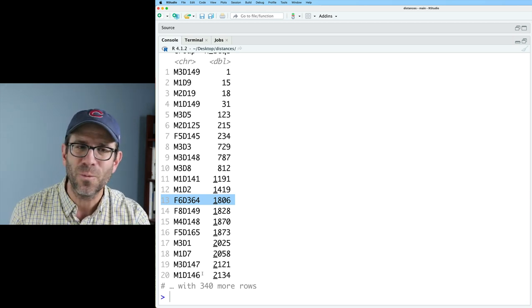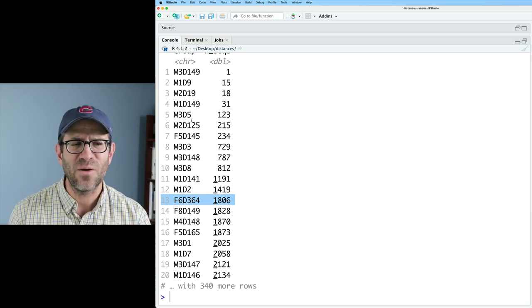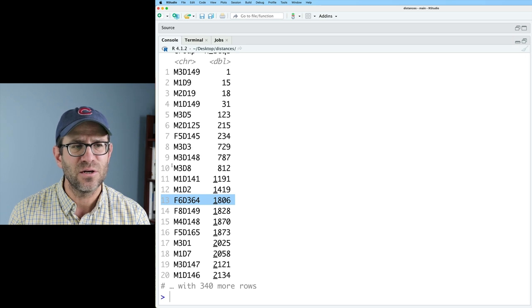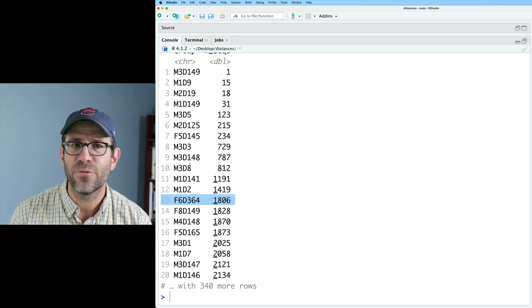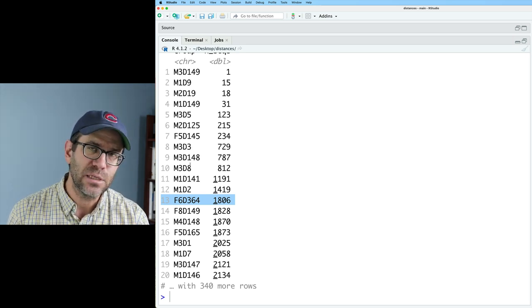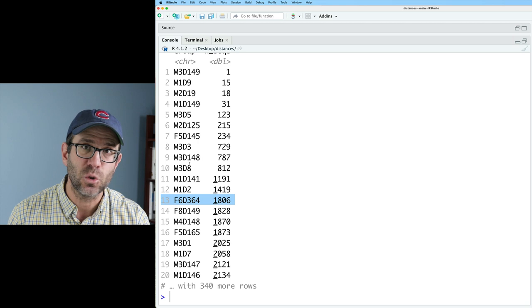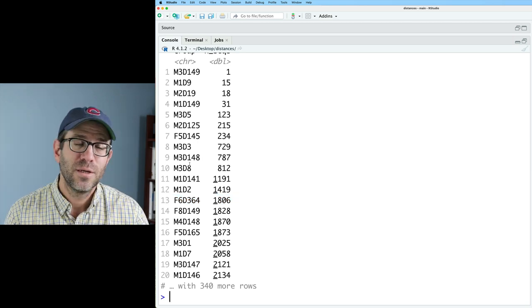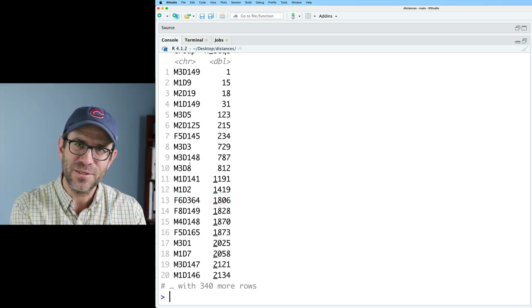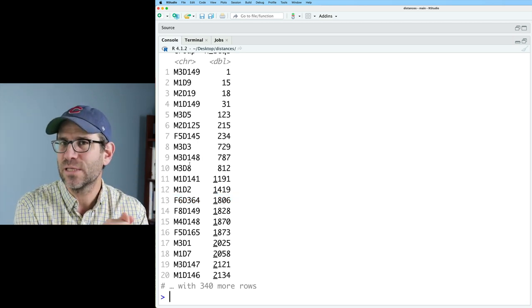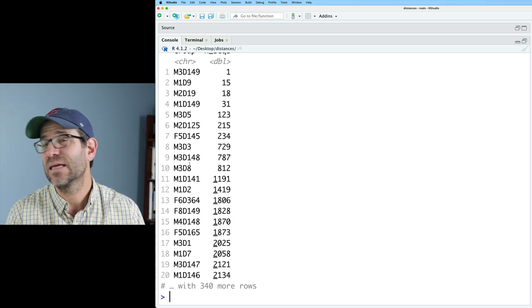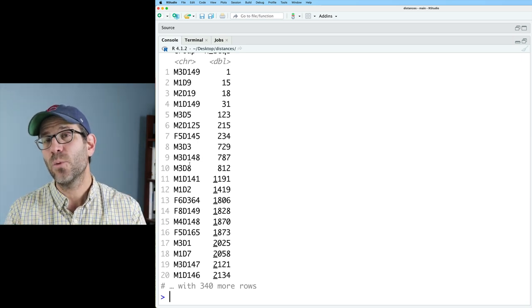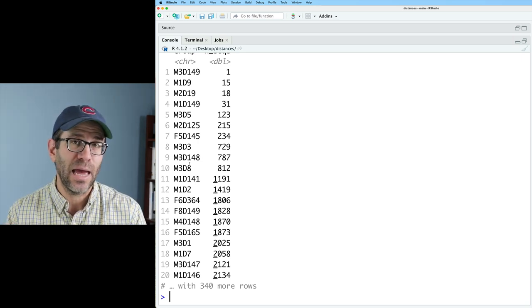It's a starting point. And so you might want to increase the number and you might be happy to decrease the number. I'm happy with using 1806. I think that's about what we used in the study. In the end, I wasn't so concerned about male one or male three, losing those samples from the overall story that we told. So I said, there are two things we needed to worry about. The first I mentioned, what samples are we losing? The second is, what can we do with that sampling depth that we have?